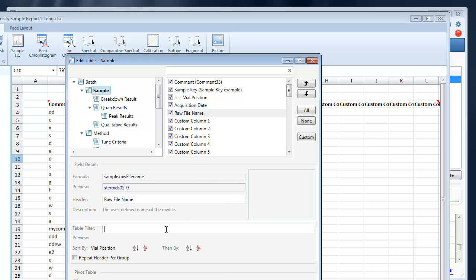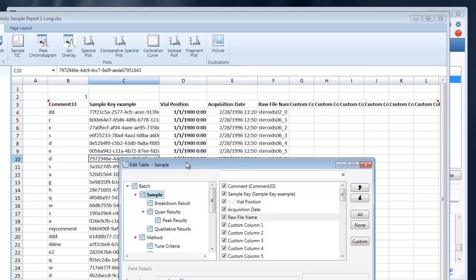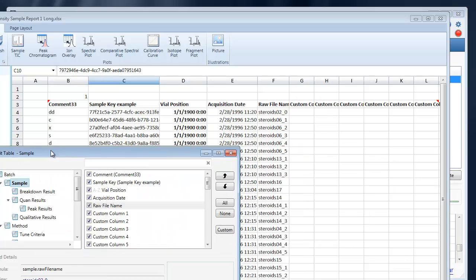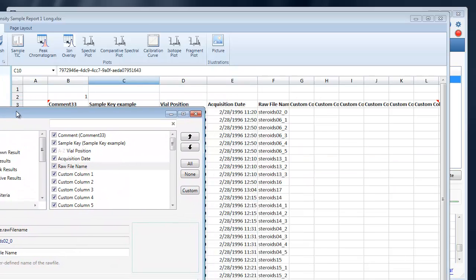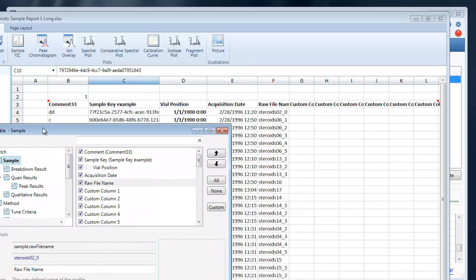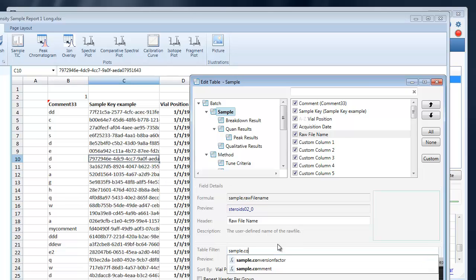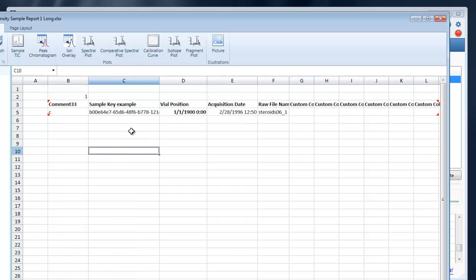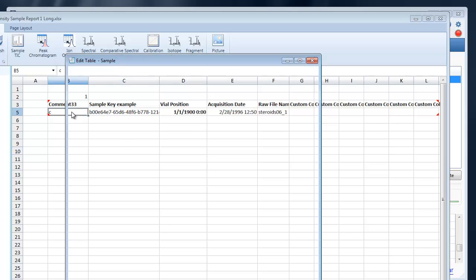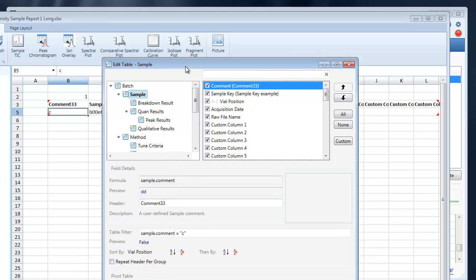You also have the ability to filter. So let's say I wanted to filter by comment equal C, and that will filter down to that value. We'll talk more about table filters and advanced formulas in another tutorial.